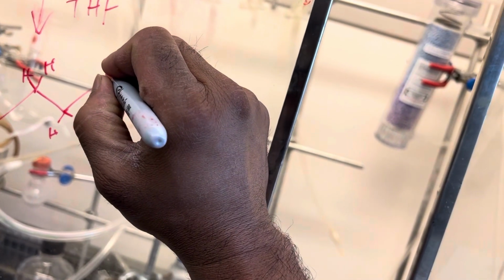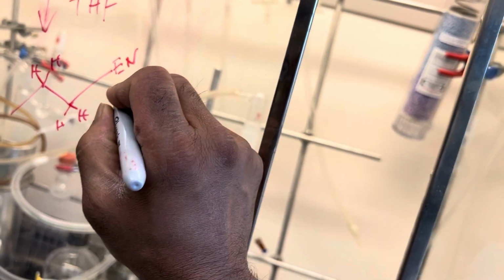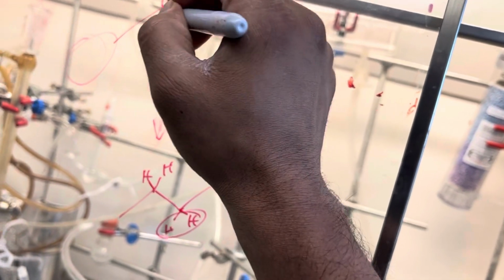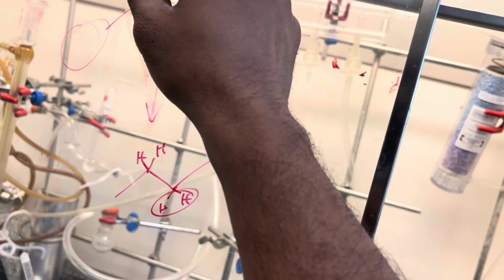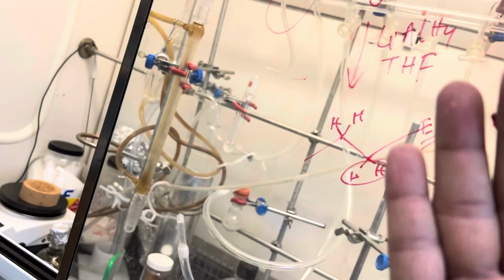But next to this carbon there will be an electronegative atom, so you might see this proton a little bit downfield, above 2 or so. In some cases, if those two protons are not a clear signature peak, you can also check the carbon NMR. You should know the carbon NMR of the starting material, where those two carbonyls are. And in your crude, if you see those carbonyls are missing, that means the carbonyls got reduced.